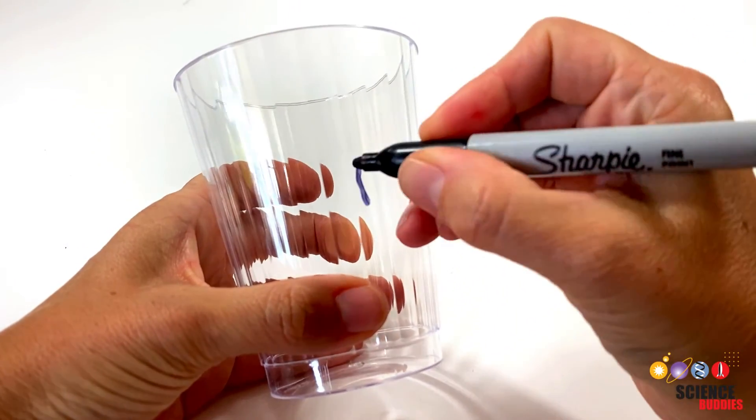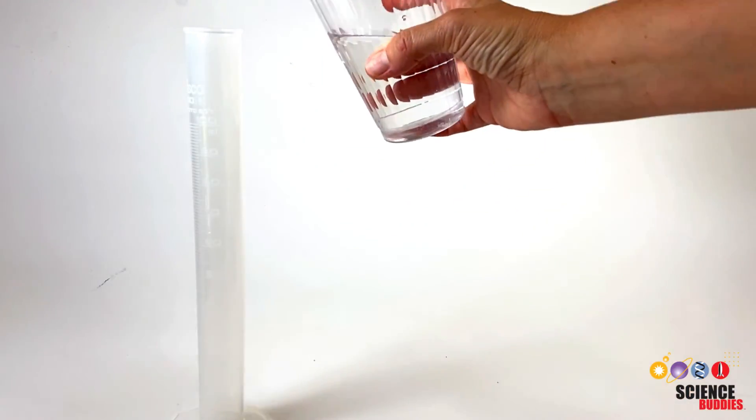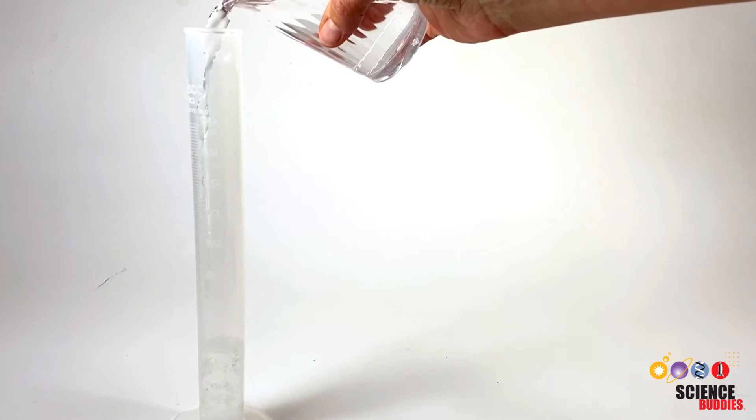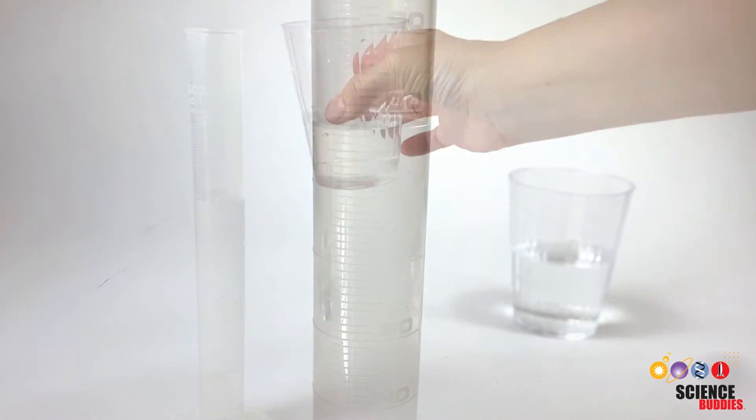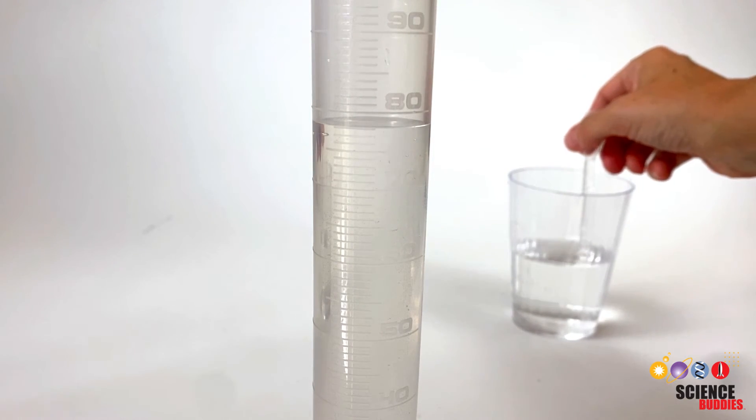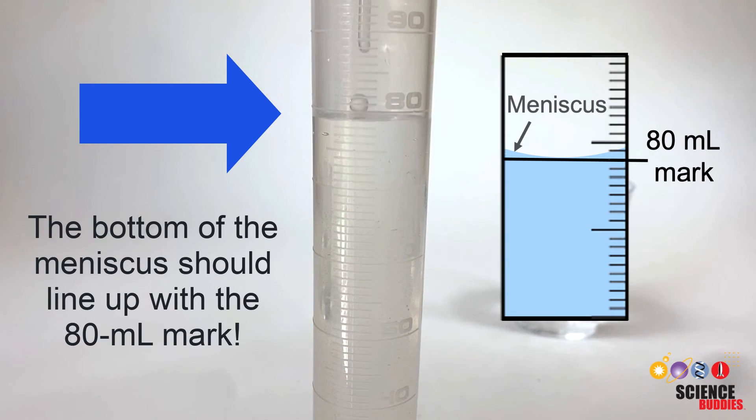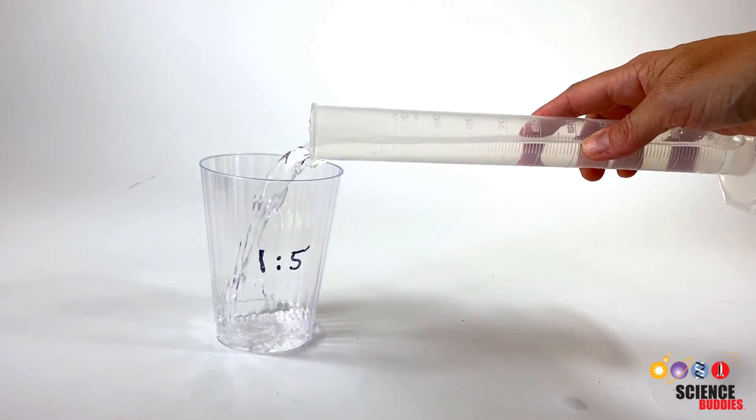First, we label our cup with the dilution we want to make. Then, we fill a graduated cylinder with 80 ml of water. To make our measurement as accurate as possible, we use a transfer pipette for the last couple of ml. The bottom of the meniscus should line up with the 80 ml mark. Now, we fill the water into our dilution cup.